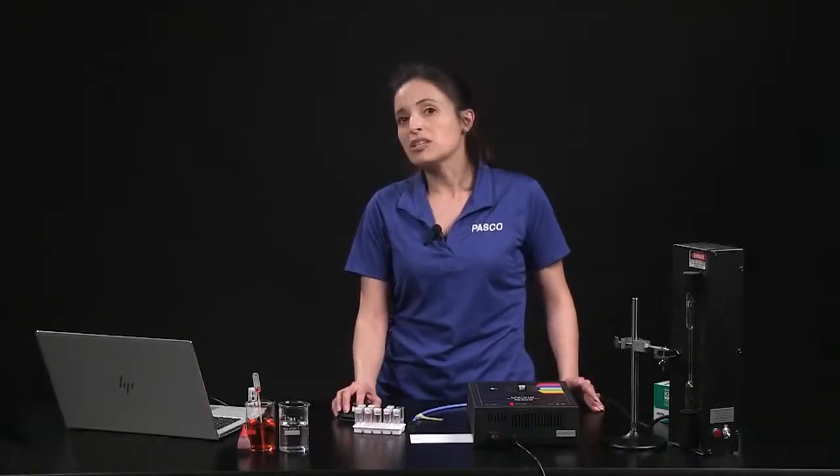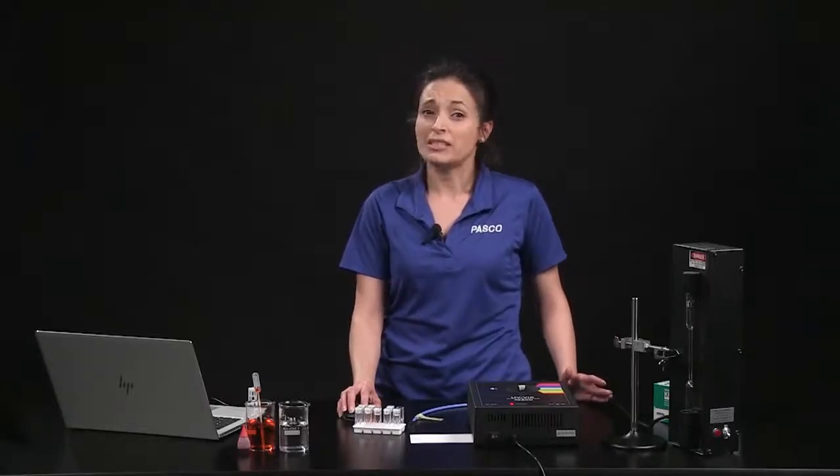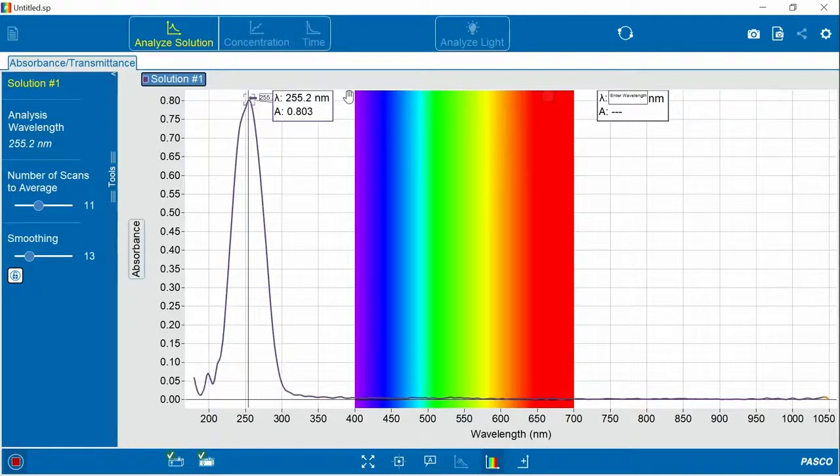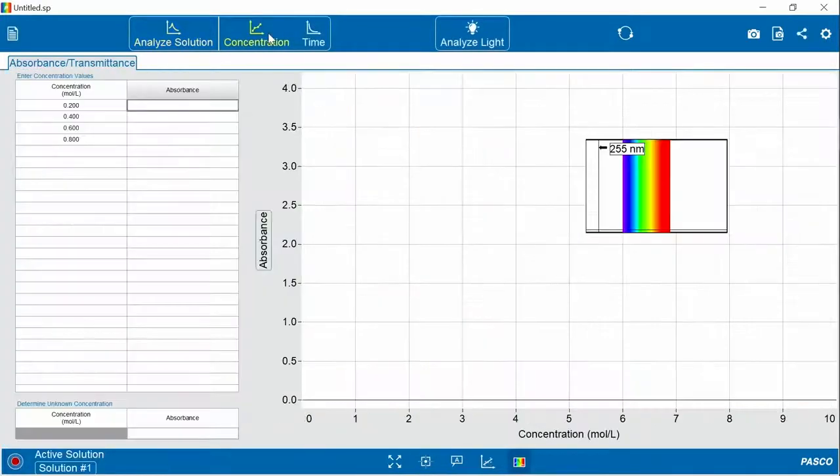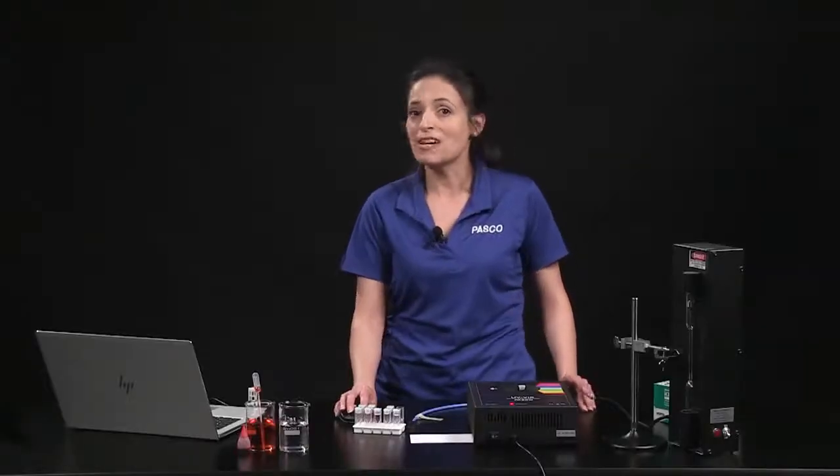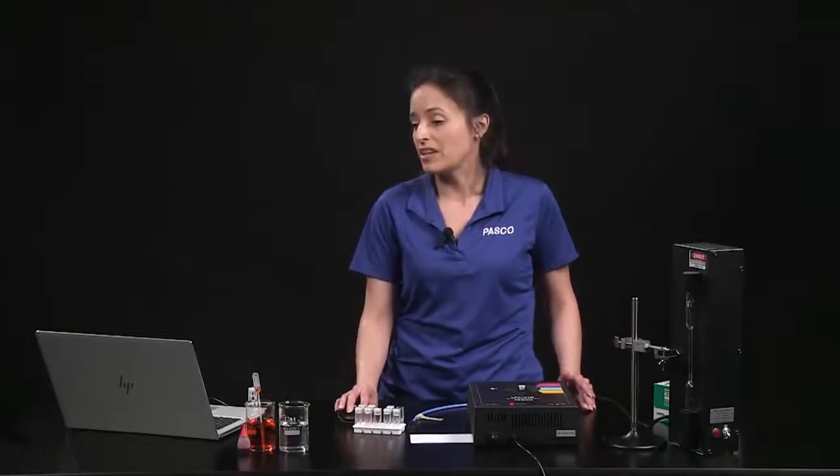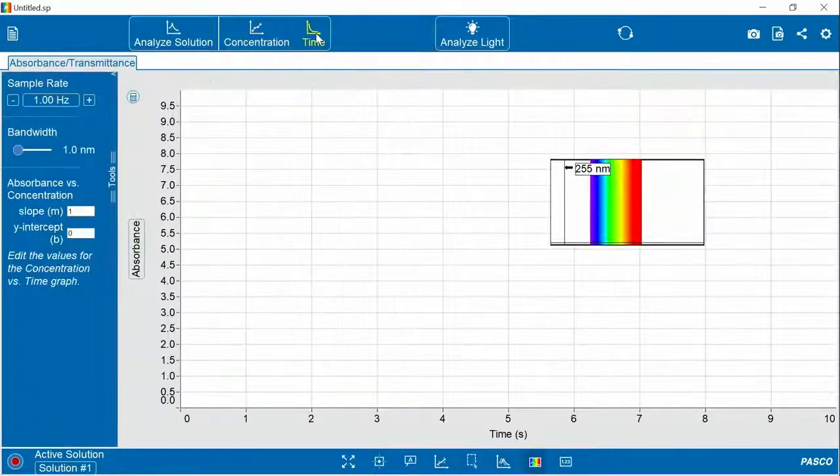I've just shown you one way to look at solutions. But you can complete a Beer's Law analysis to determine the unknown concentration of the solution if you keep your selected peak, stop collecting data, and move to the concentration tab. Or you can investigate factors that affect the rate of reaction, such as redox or hydrolysis reactions, when you move to the time tab.